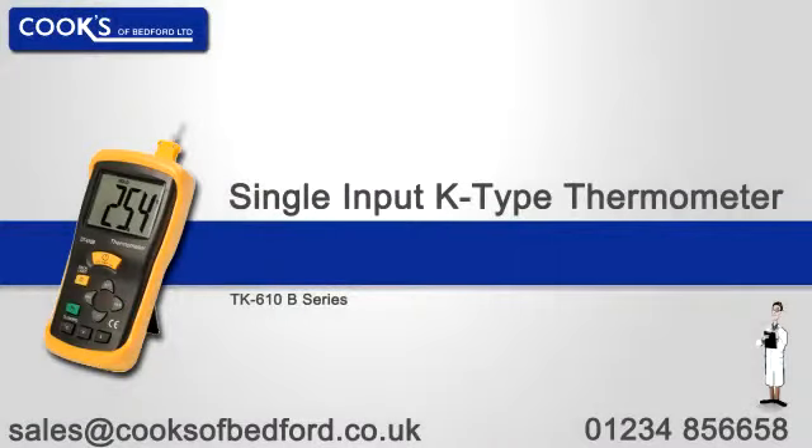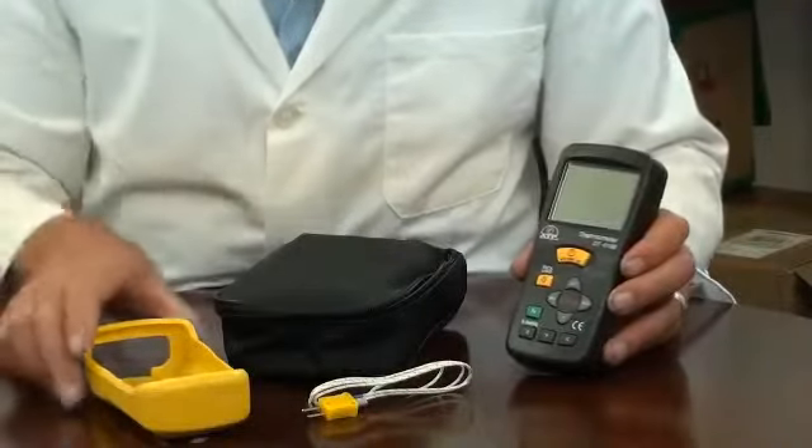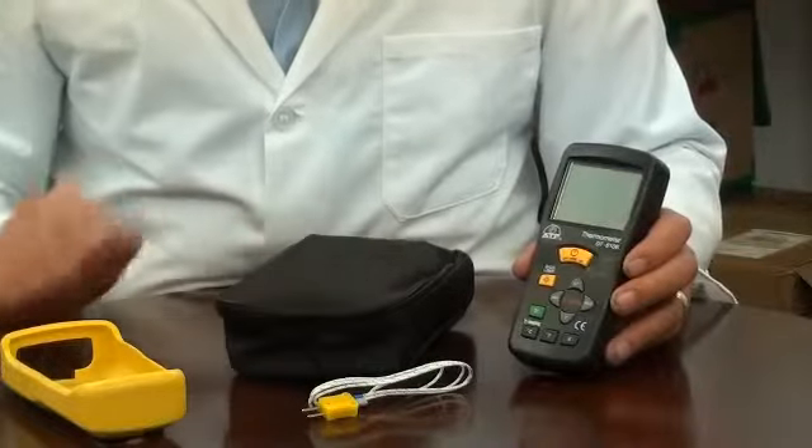An introduction to the TK610B K-type thermometer. It is supplied with a 1m long plug-in wire thermocouple probe, a rubber protective holster, a soft carry case and battery.